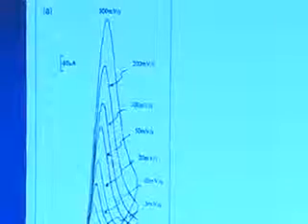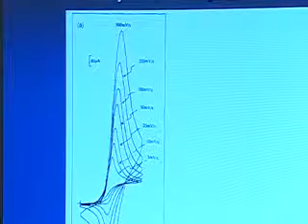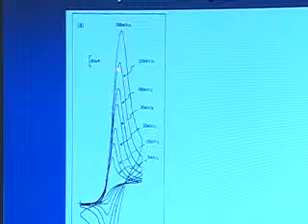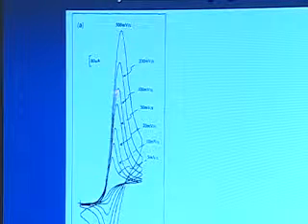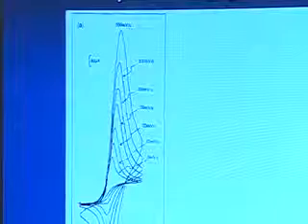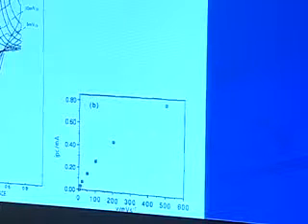And you can see that there is some sort of scan rate dependence here that is obviously not linear. For example, there's 200 and there's 500, and 500 would be a little more than twice as big as 200 if it was linear, so it's not linear. If we make a plot of that, we can see it's not linear, and by eyeballing it, it looks like it probably goes as the square root of the scan rate, which it does in this case.